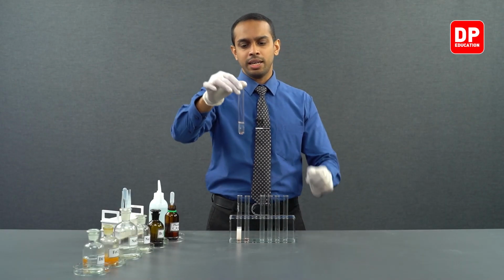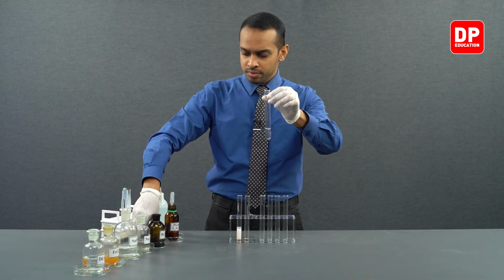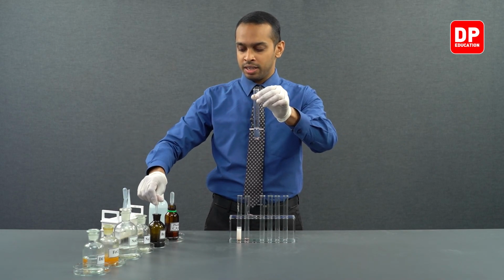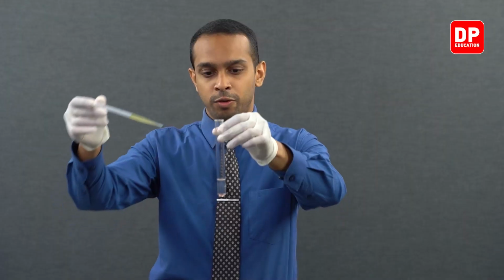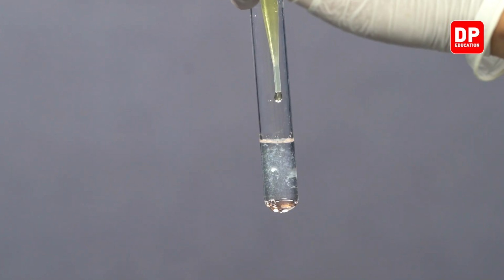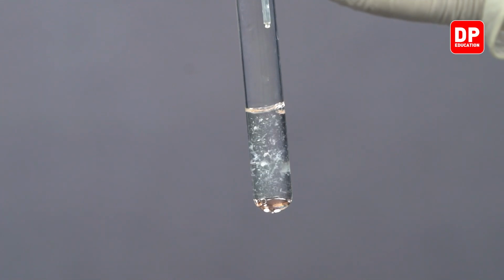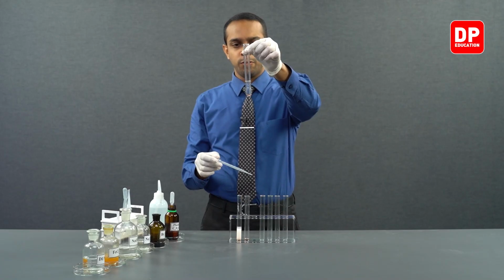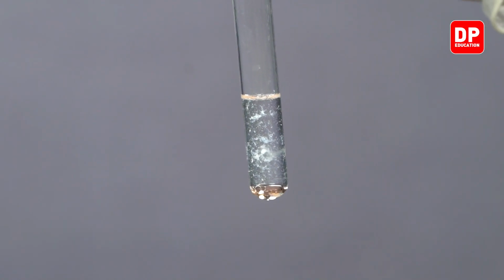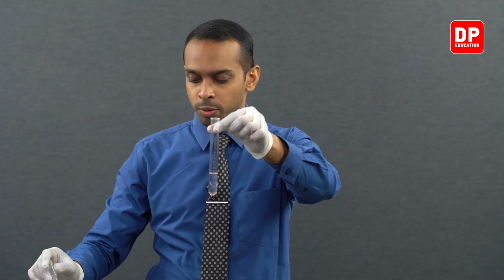Now, let's add a little bit more bromine water to see whether we can see a change in color or whether we can see a bit more precipitate forming here. As you can see, when I add more and more bromine, the precipitate that is formed increases. The precipitate that you see here is 2,4,6 tribromophenol.